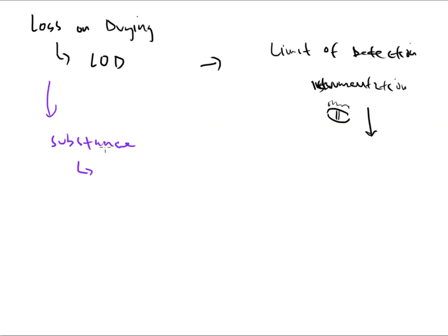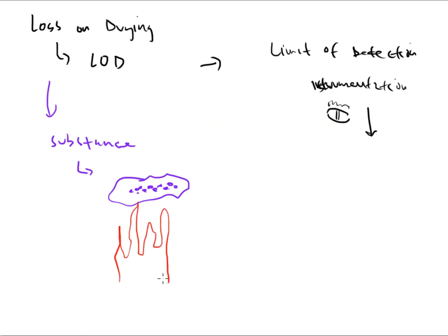So when it concerns this substance, this is what happens. I've got this chunk of stuff, and this chunk of stuff probably has some moisture that's associated with it. Well, what we do is that we heat this substance up, and that's supposed to be a flame right there. Didn't do a very good job. And typically it's not an open flame, but that is the best way that I know how to represent heat on a drawing slide.